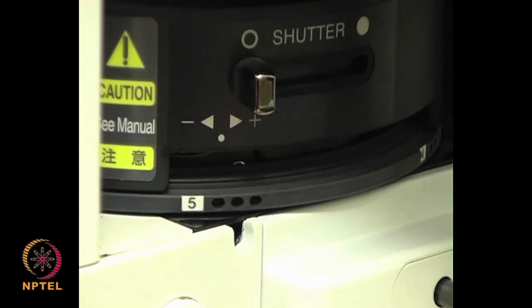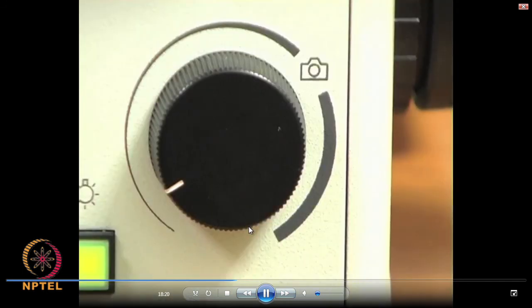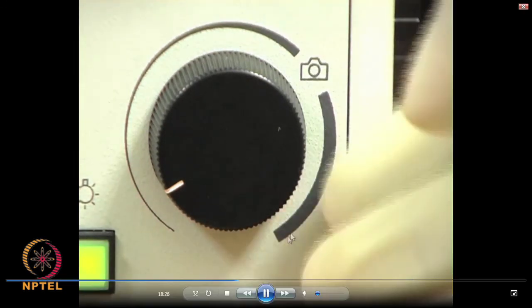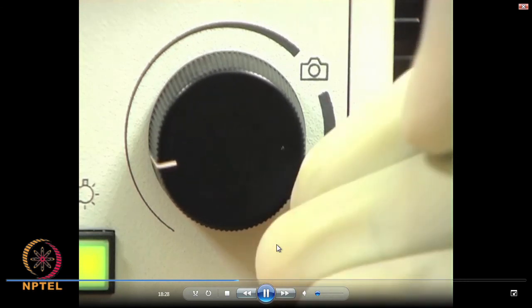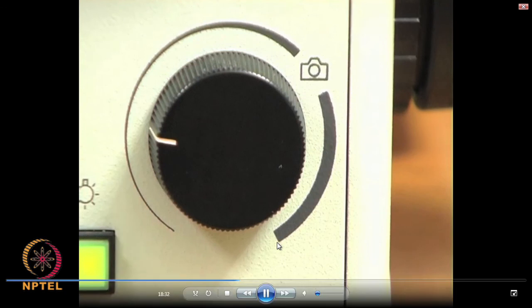Only then will we see how the contrast is enhanced. So, again we are setting the condenser aperture, which is below the objective, to bright field mode and increasing the intensity of the light. Then we will look at the glass microspheres structure, how they appear on the monitor.